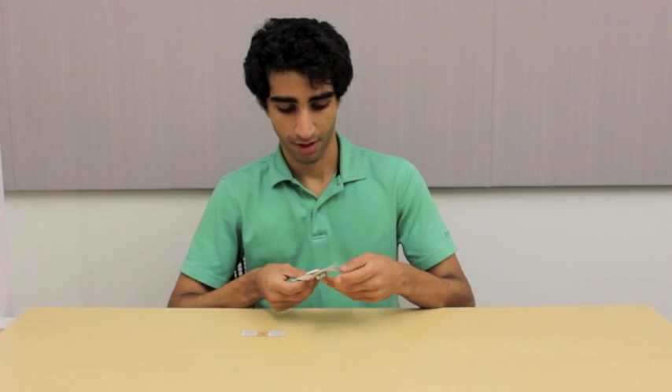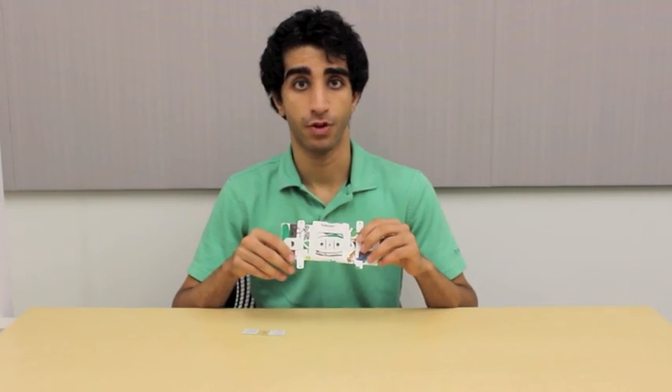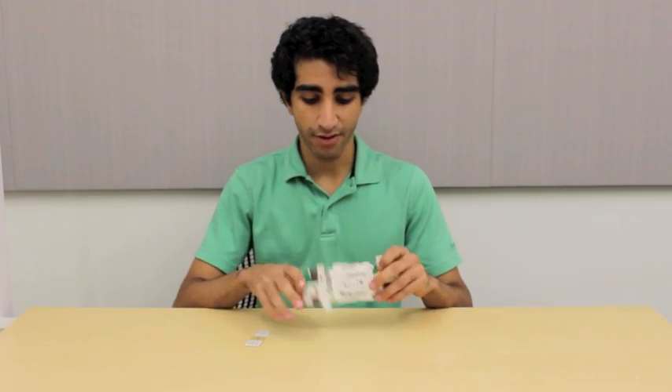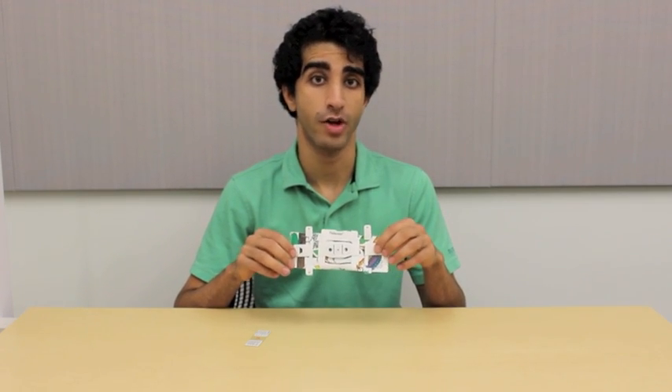Hello and welcome to our tutorial on how to use your Foldscope. The parts you'll need for this tutorial are a folded Foldscope and one pre-made slide. If you haven't folded your Foldscope yet, you might want to watch our first tutorial where I show you how to do that.